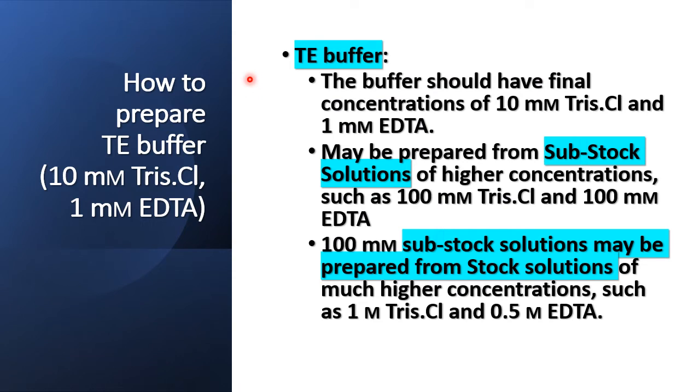Here I take the example of one of the simple solutions, Tris-EDTA buffer. Although this is a simple buffer, you can use the same information for more complicated solutions. And the information I have just discussed earlier about the molar concept and C1V1 will all be used here.